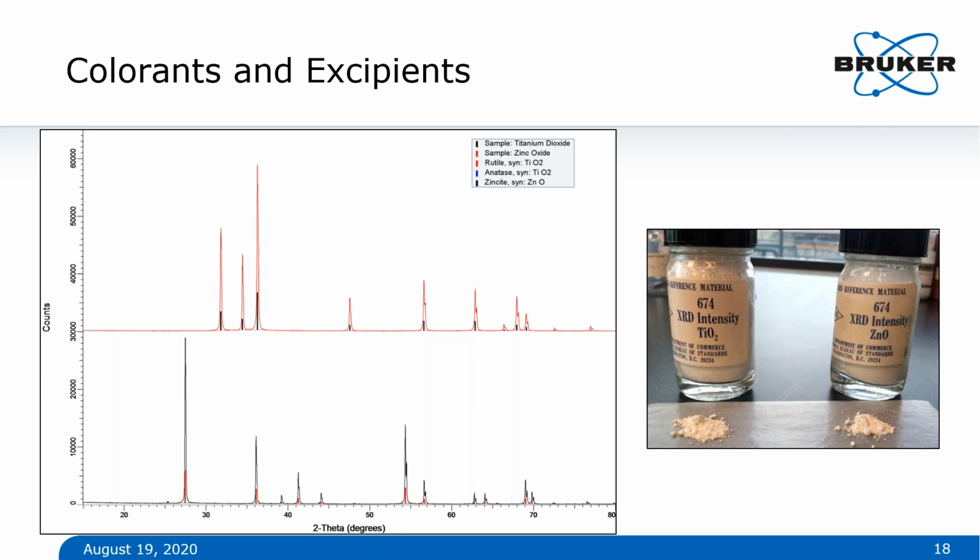10 minutes to half an hour, depending on the amount of sample. There are a lot of caveats here, unfortunately, so it's hard to give an exact answer. Rule of thumb, I would say probably 10 to 15 minutes, maybe half an hour if you don't have a lot of material.